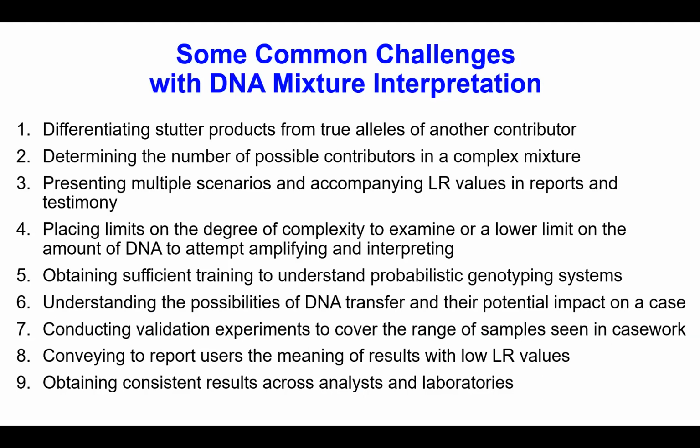You're also dealing with many scenarios when trying to present that data and make it understandable. That's something beyond what's done in the lab; it's how you communicate those results to someone else. The challenge is often placing limits on the degree of complexity that a lab will examine, and sometimes even the lowest amount of DNA they may consider amplifying and interpreting. That varies by laboratory, and that makes this challenging as well.